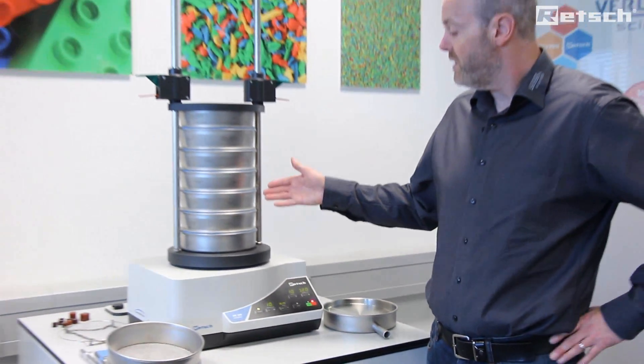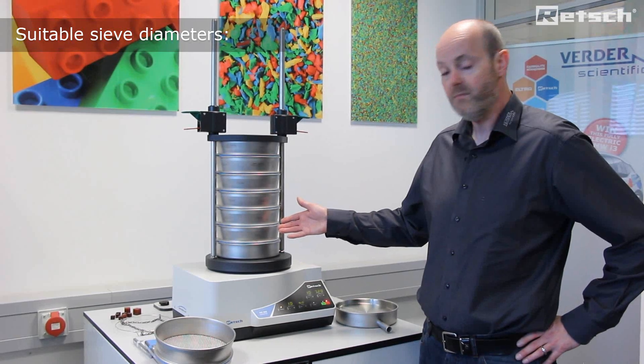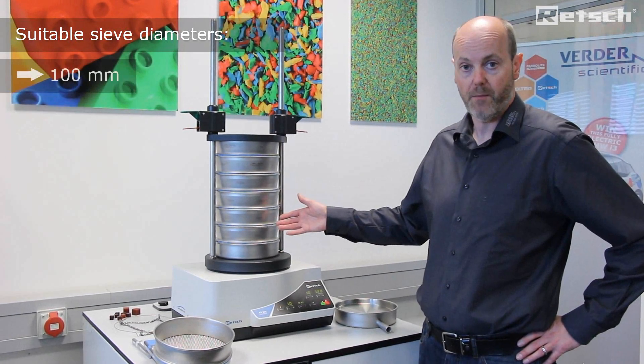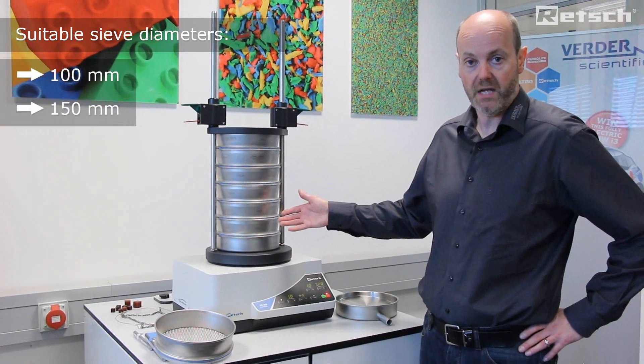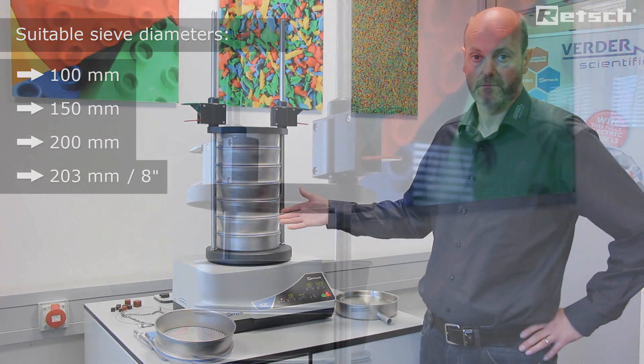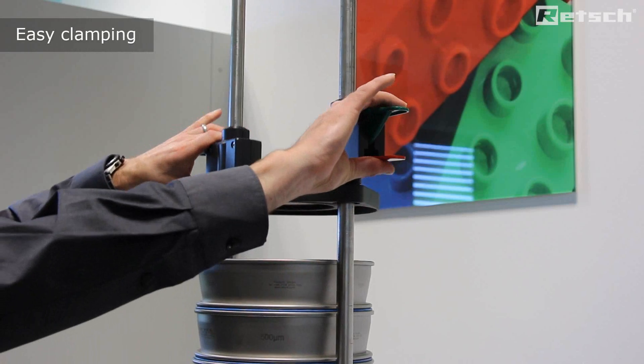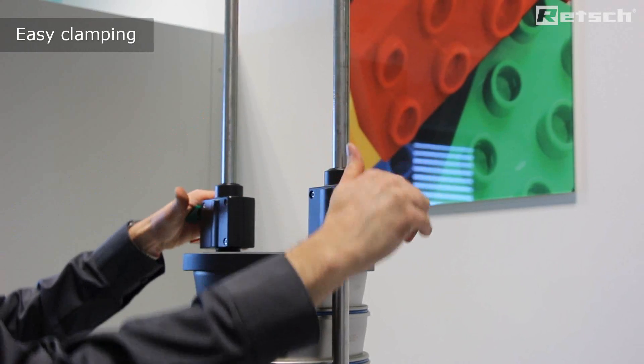The AS200 control can accept test sieves with a frame diameter of 100mm, 150mm, 200mm, and 203mm. The sieve stack is secured to the sieving plate using the clamping device. Here we can see the comfort clamping device, which optimizes user friendliness.